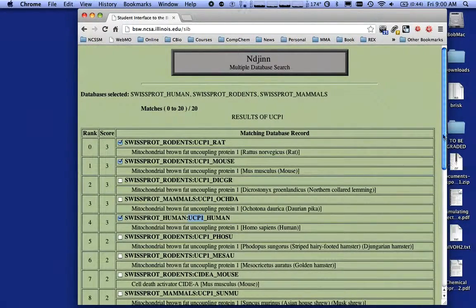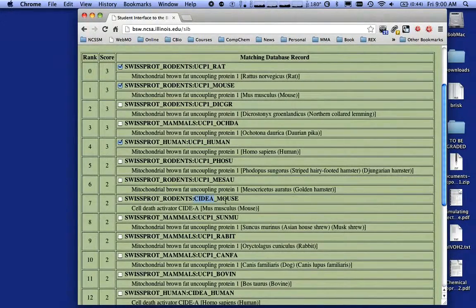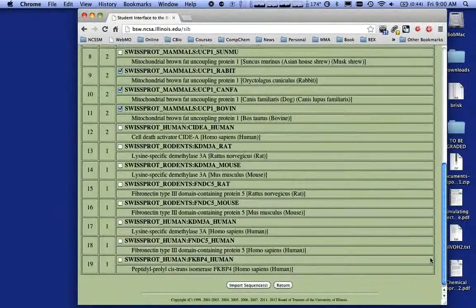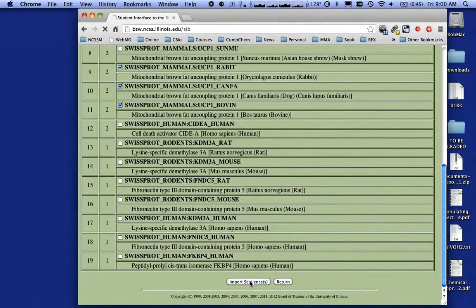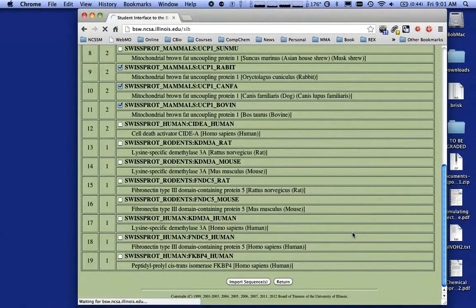Don't just look at the organism — make sure if you're going to compare these, they all say UCP1. Notice here one says mouse but it's actually a different protein, so be careful. I want the rabbit, a dog, and a cow. That looks like the end of my UCP1 proteins. I went ahead and selected all the UCP1s for some common organisms, including humans. Now I want to import these sequences — this will take a few minutes.